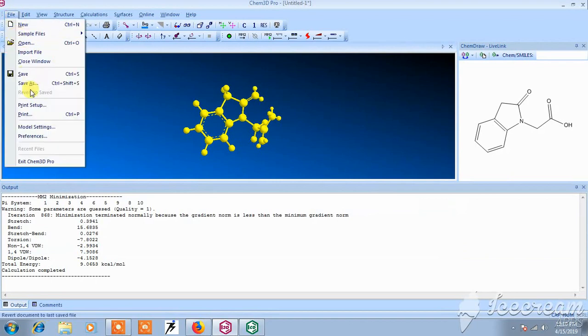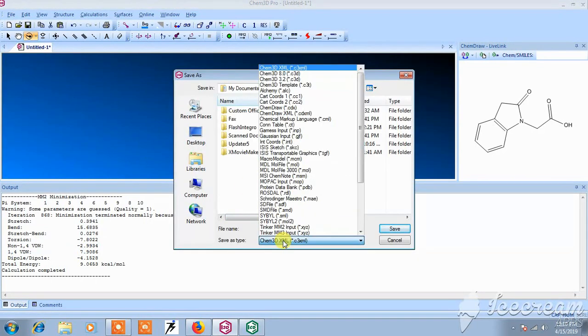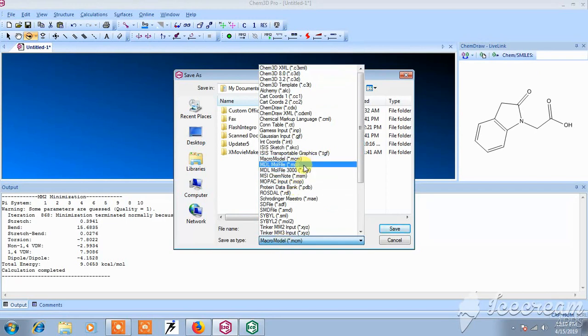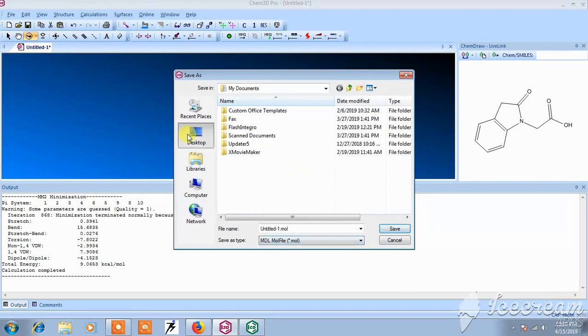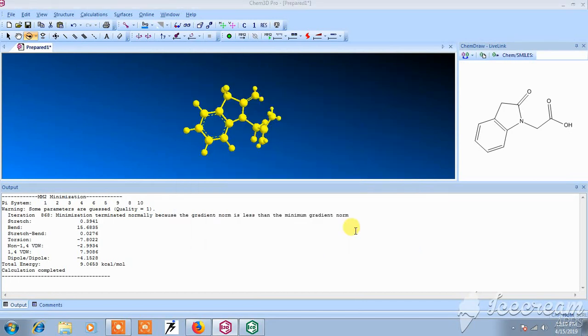Now save this structure, save as in mole format for your next studies. In this way you can save the prepared structure.